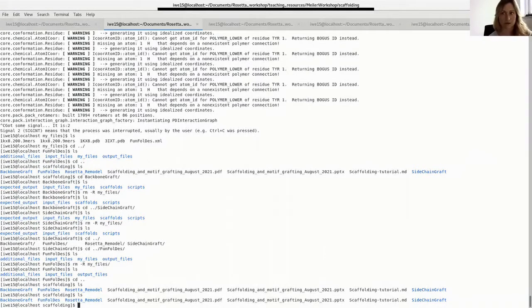This is actually a pretty straightforward tutorial, but you should really open up things and look at them in order to understand what actually is happening. You learn the most by really understanding what's happening, and only then you'll be able to transfer to your own projects and problems that you're interested in.